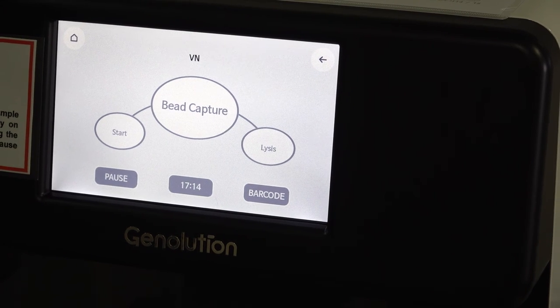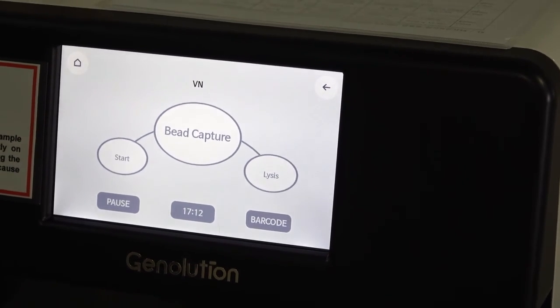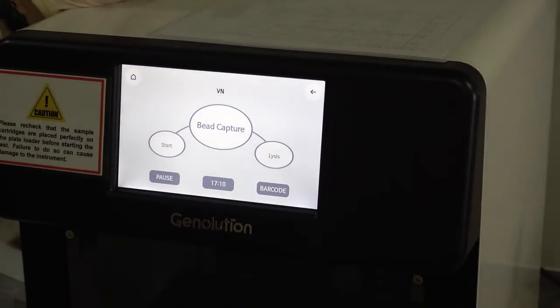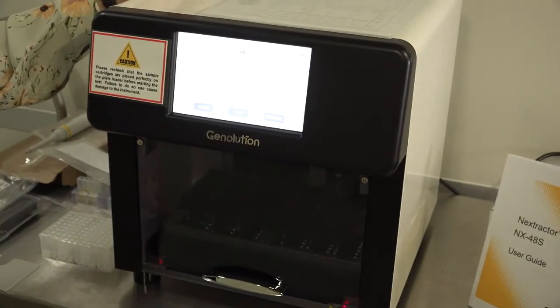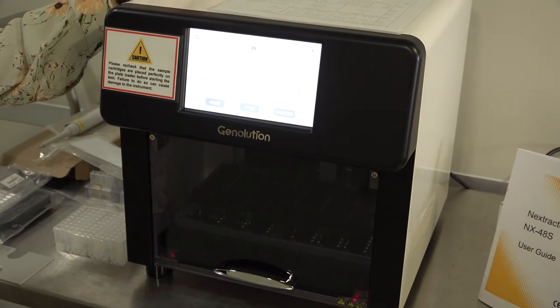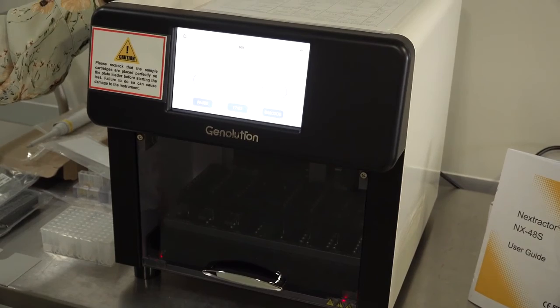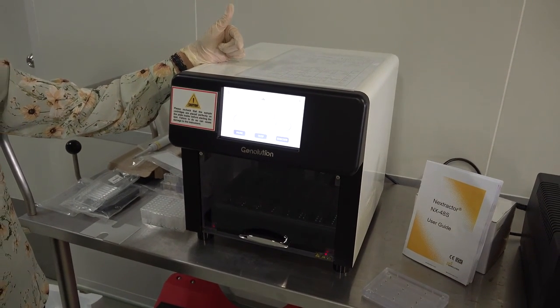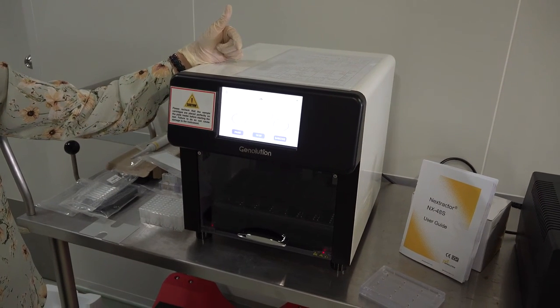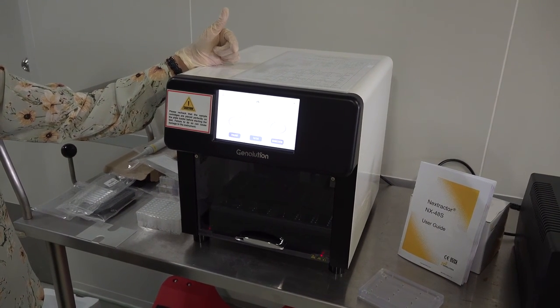You will start, you will have a bead capture, lysis and then there will be an elution step. That basically covers the operating procedure of this particular machine which is the Nextractor NX48S from Genolution. Thank you very much for watching the video and we will proceed to the actual lab practice in our BSL-3 laboratory. Thank you very much.